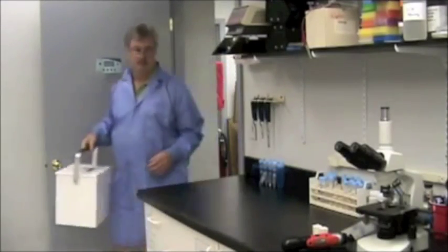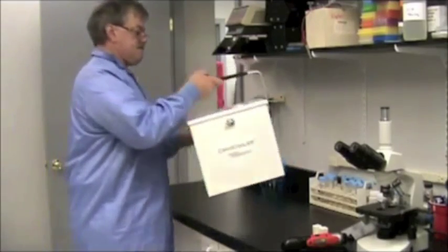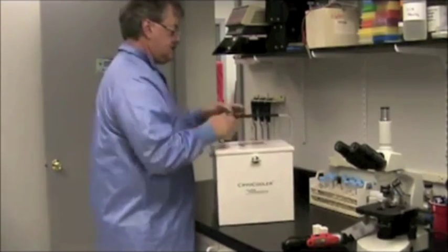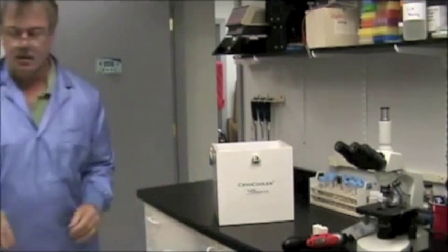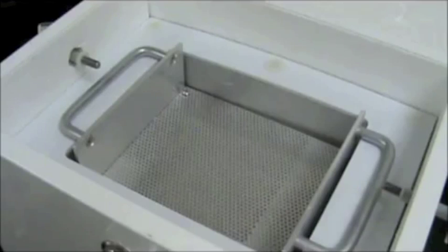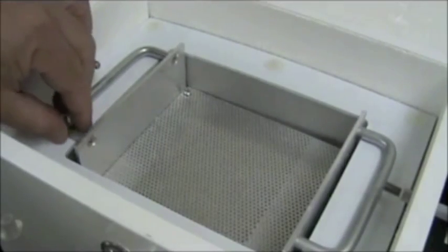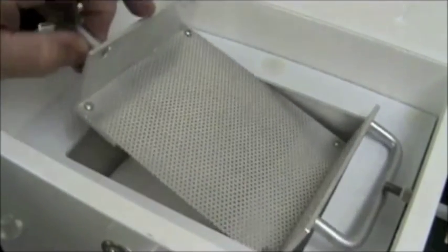The Cryo Grinder system requires the use of liquid nitrogen, thus a container is necessary to hold the Cryo Grinder during sample processing. One option is the Cryo Cooler, which was specifically designed for this purpose. It acts as a reservoir for liquid nitrogen and serves to keep the mortar, pestle, and the sample cold throughout processing.